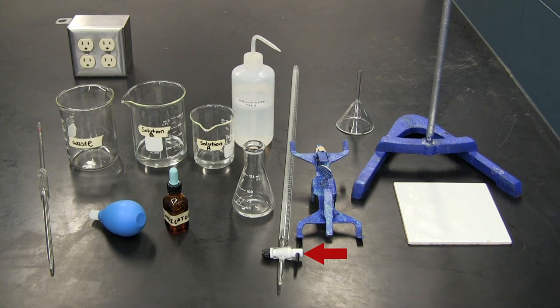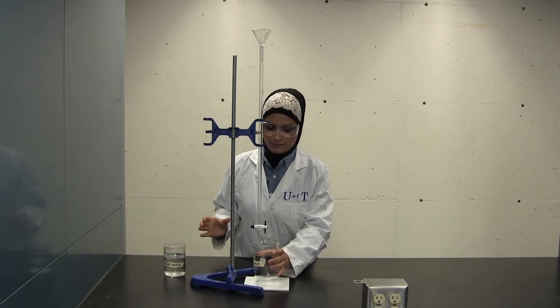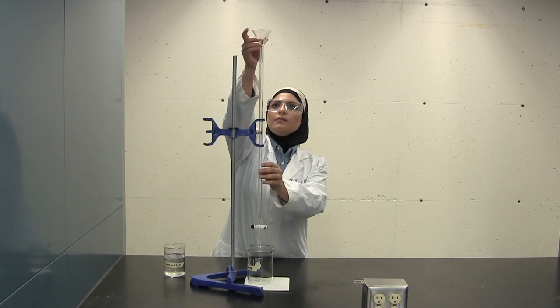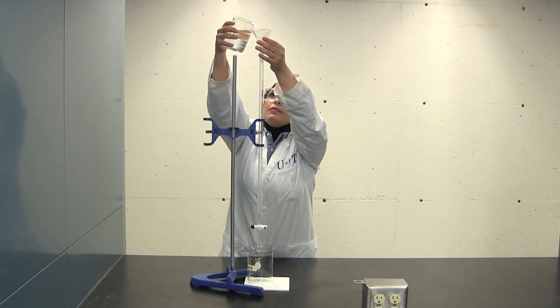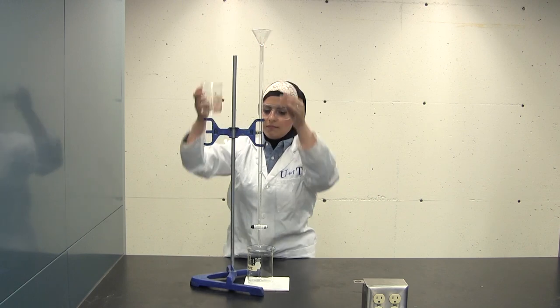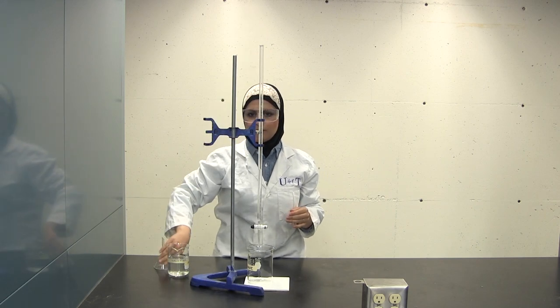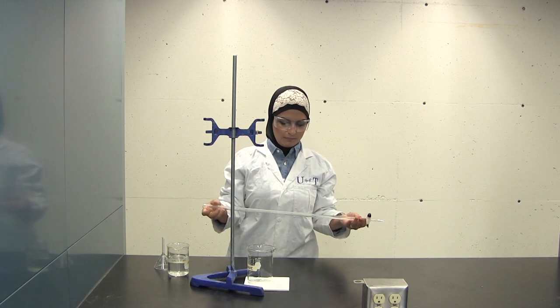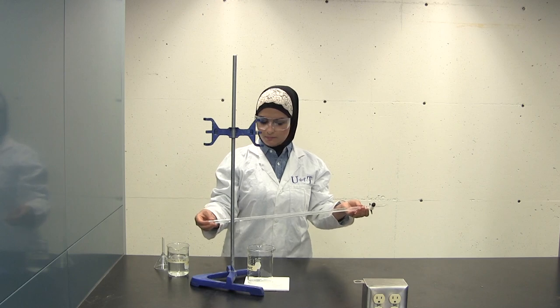After that, place a short stem funnel on top of the burette. Obtain a large beaker, label it waste, and place this beaker on top of the white tile just under the burette. Obtain another beaker and fill it with distilled water to rinse the burette. Fill the burette with distilled water to about a quarter of its height, then remove the burette from its clamp and swirl it to ensure thorough rinsing. Make sure to coat all the sides of the burette. Drain the water into the waste beaker through the burette tip as well as the top of the burette to rinse completely.